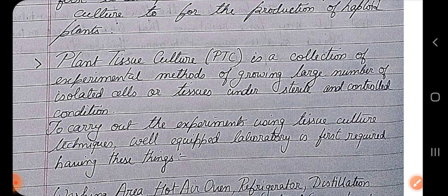Just like you have seen in microbiology how we maintain the petri plates that contain the bacterial culture aseptically, even a slight mistake can cause contamination from the air. Here also we maintain the plant tissue culture in a very sterile condition. A minute mistake can lead to destruction of your whole lab setup.